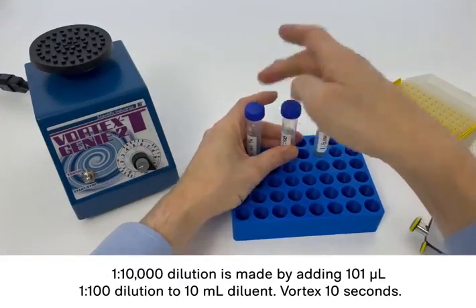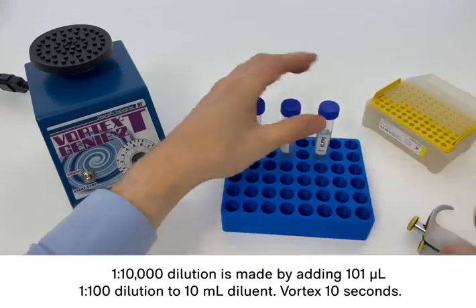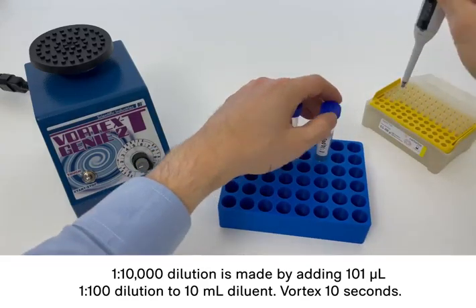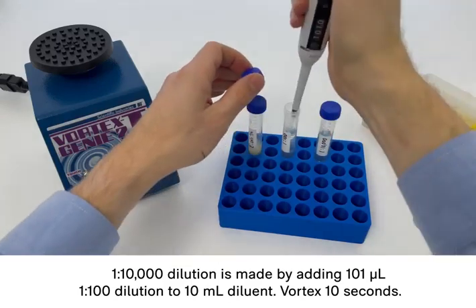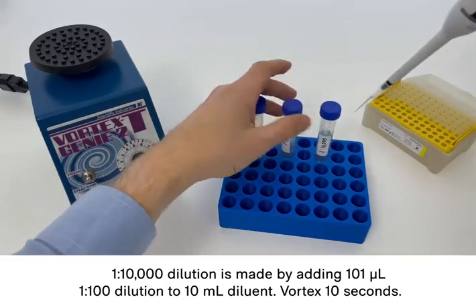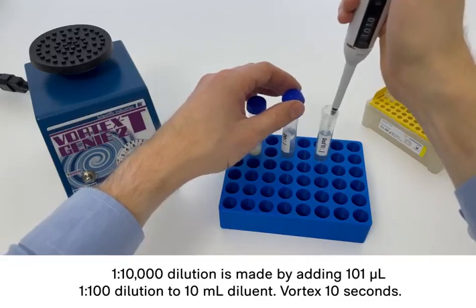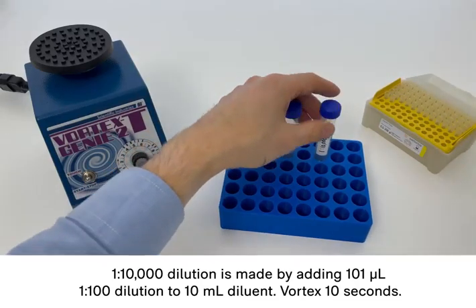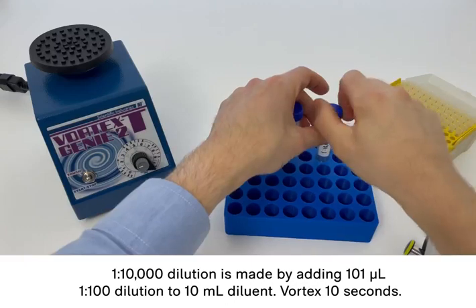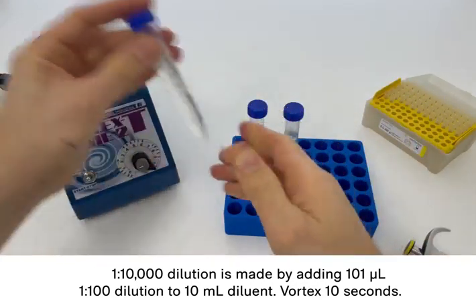As I showed you on the previous illustration, the 1 to 10,000 dilution is made by doing a 1 to 100 dilution of the 1 to 100 sample. And now I vortex again, this time for 10 seconds.